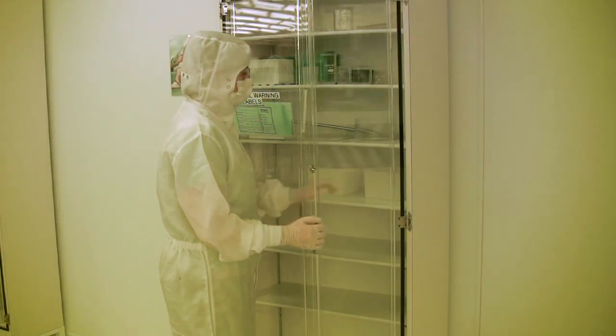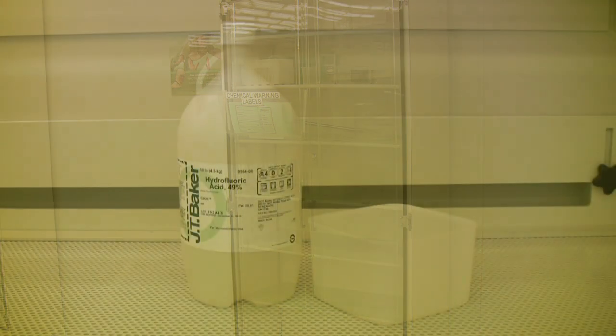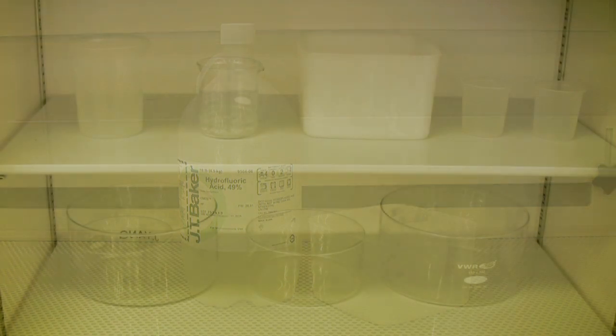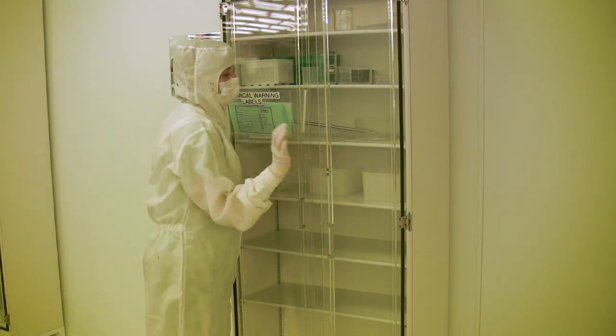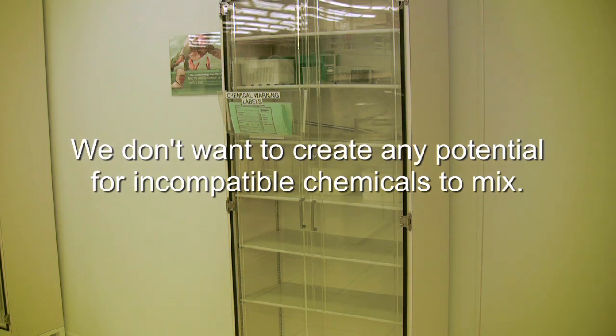Make sure that you use the appropriate chemically compatible labware for the chemicals you intend to use. For instance, hydrofluoric acid will etch glass, so the labware you use must be made of polyethylene or Teflon. As a general rule of thumb, use labware that is made of the same type of material as the bottle the chemical comes in. The labware should be clean, dry, and free of any kind of residue when pulled from the cabinet, and should be returned in the same condition. We don't want to create any potential for incompatible chemicals to mix.